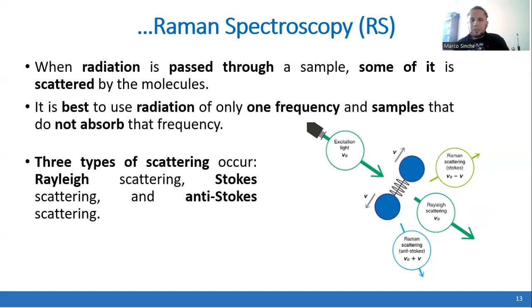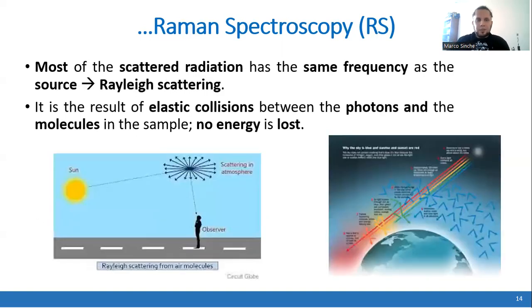But it is also possible that the interactions produce an increase in the energy or a decrease in the energy, in which cases we have these Stokes and anti-Stokes scatterings.